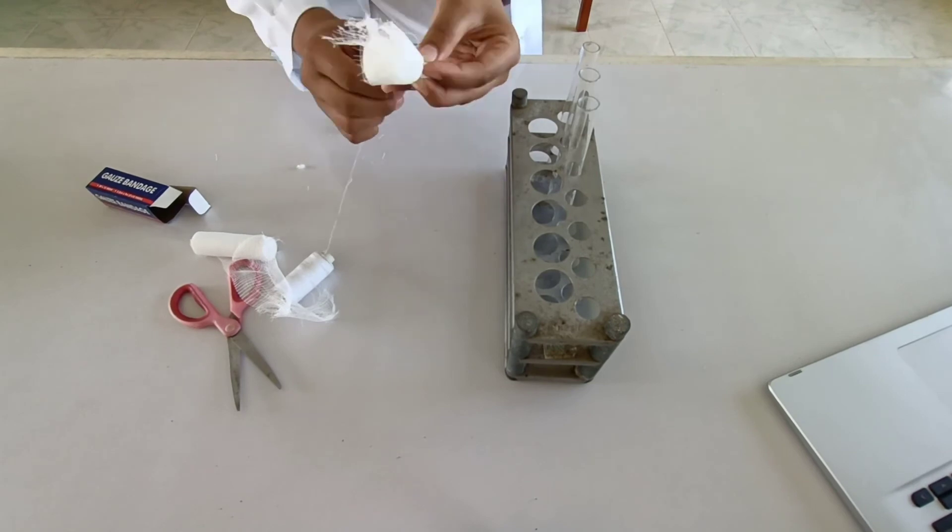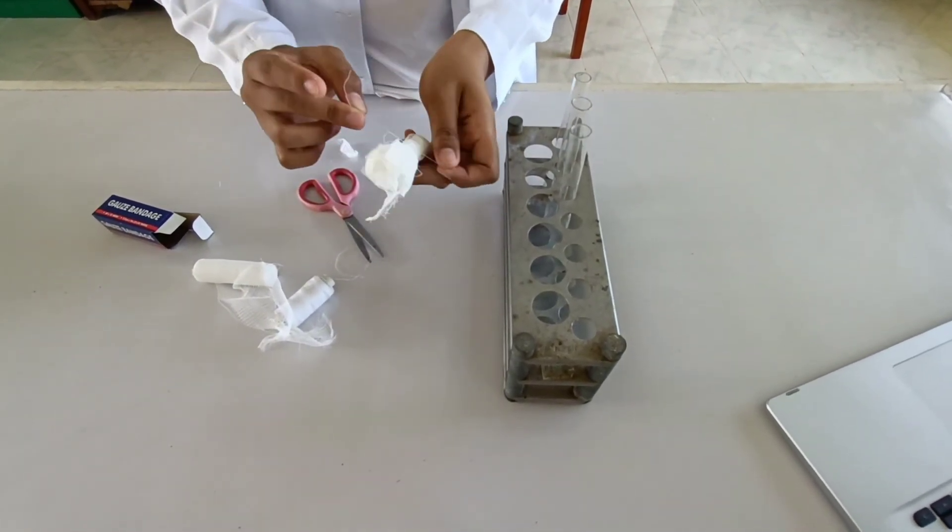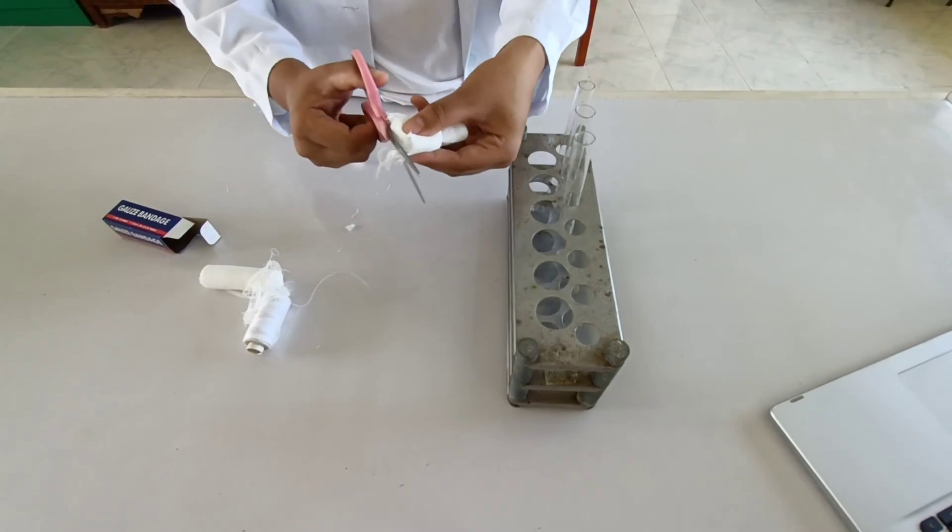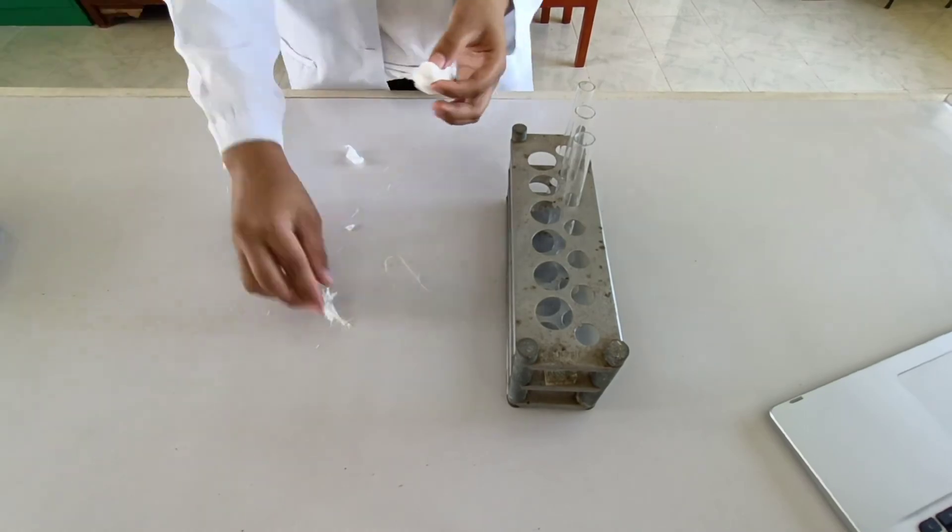Get the thread and tie it approximately one inch from the end. Then lastly, cut the extras. And here is the result in making a cotton plug for test tubes.